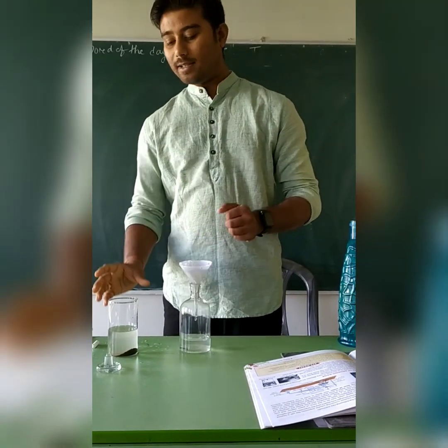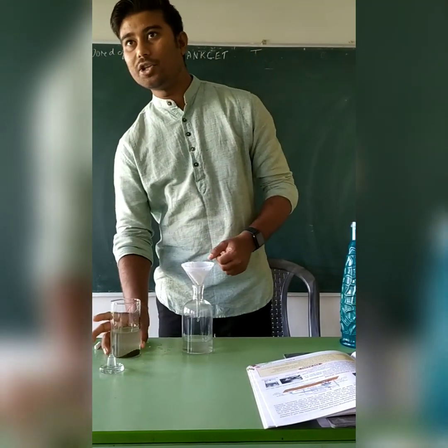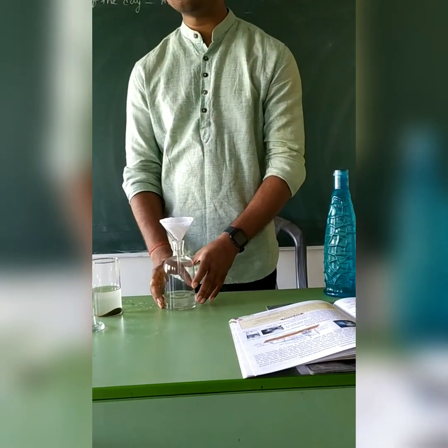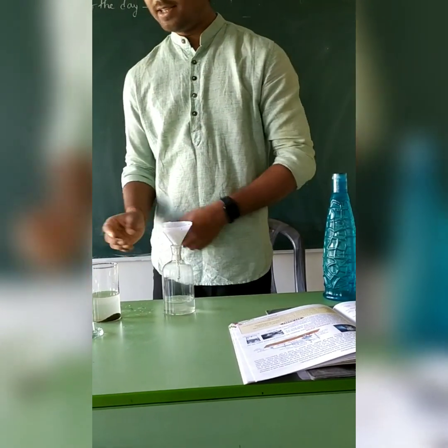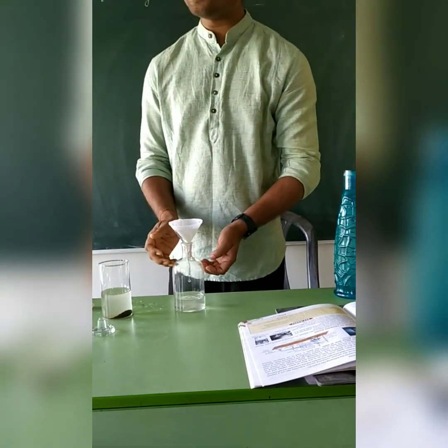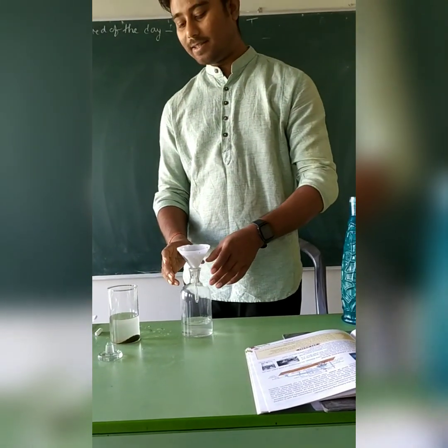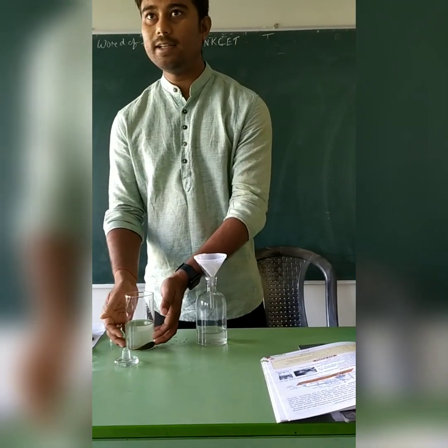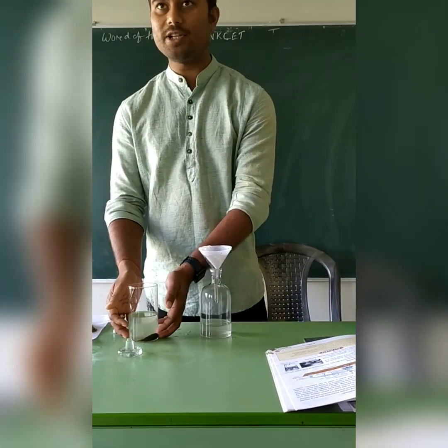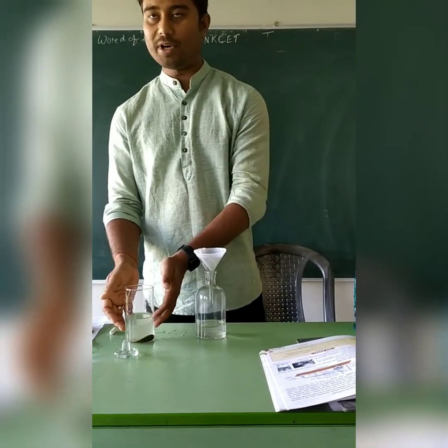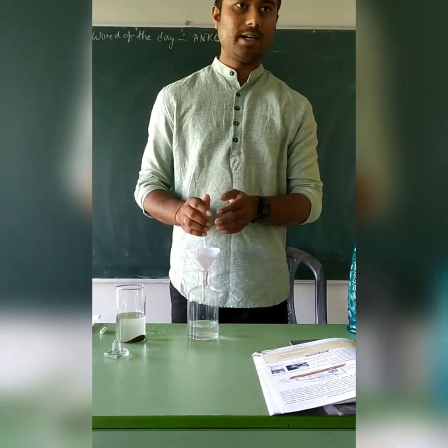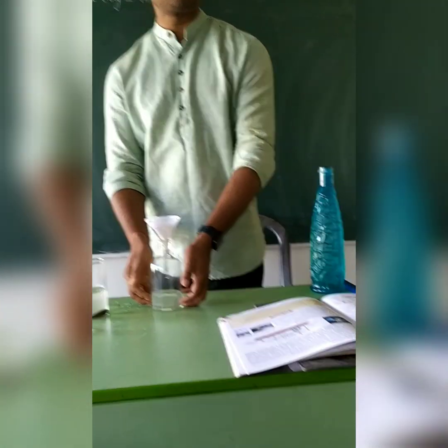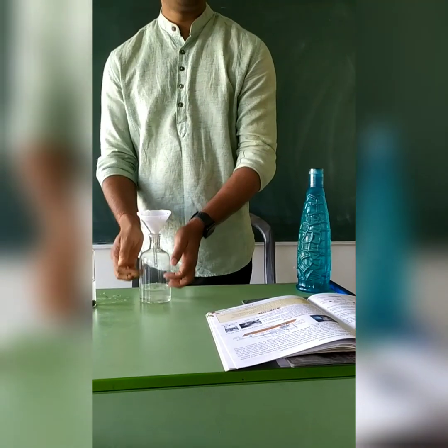So this is sedimentation. This is decantation. This is filtration. Separation is called decantation. Settling down the sand is called sedimentation. Separating the water is called decantation. And filtering the water is called filtration.